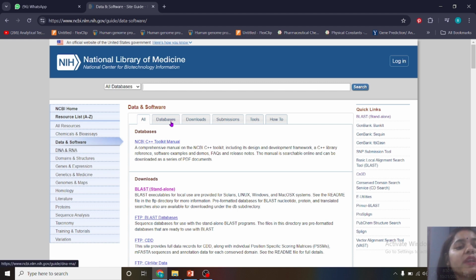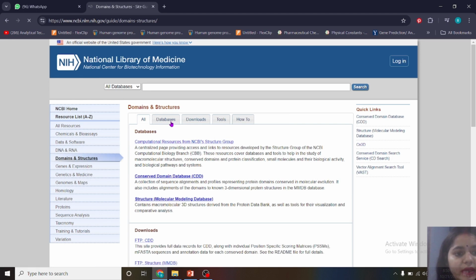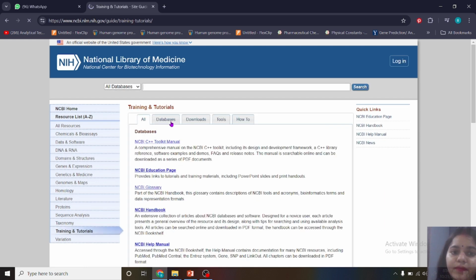If we want to know the information about DNA and RNA, then I click on this page. If we want to know about domains and structure, then we click here. If we want to know about variation, then we click on variation. If we want to know about training and tutorials, then we click on this site.